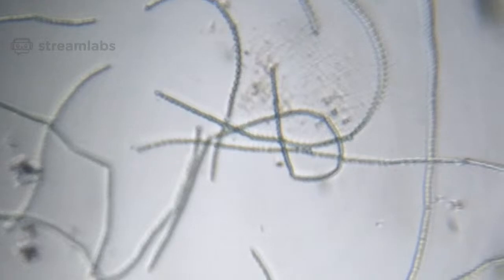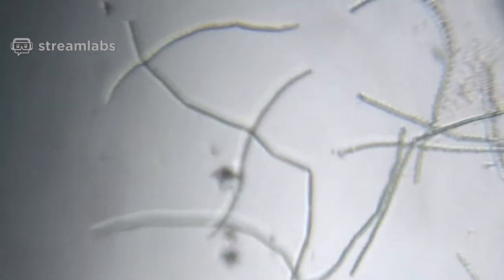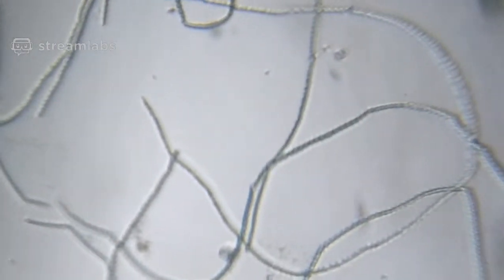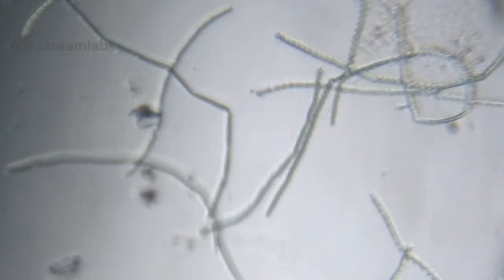I just showed you this bacterium with one specialized cell. But there are other bacteria that have fruiting bodies, that have extraordinary migration patterns, extraordinary signaling patterns. They go apart and come together. They hunt as a group. The diversity of bacteria is tremendous. The only thing is that when you look at bacteria, they just look like little circles and often like rods. But when you start applying the principles of science to them, they get extraordinarily complex. Okay, so that's so much for Nostoc.